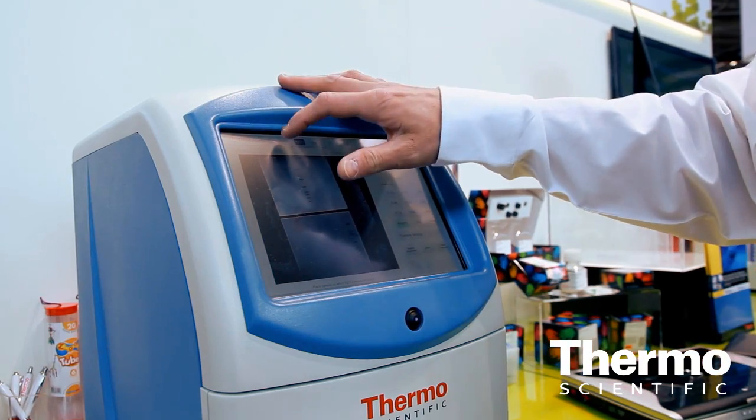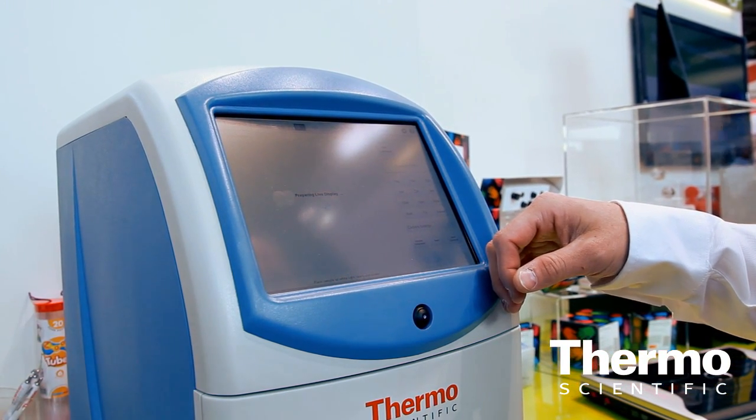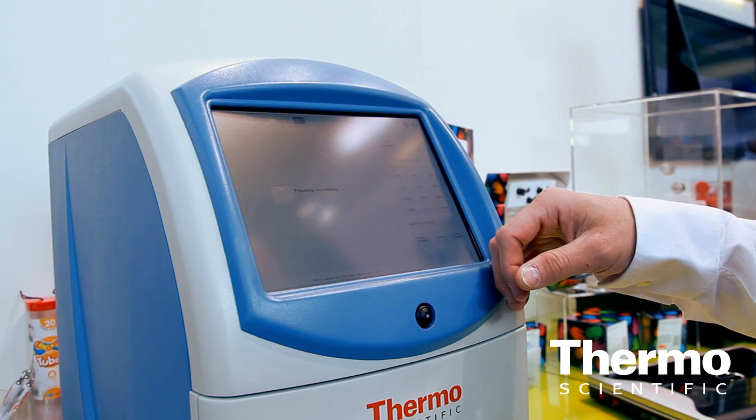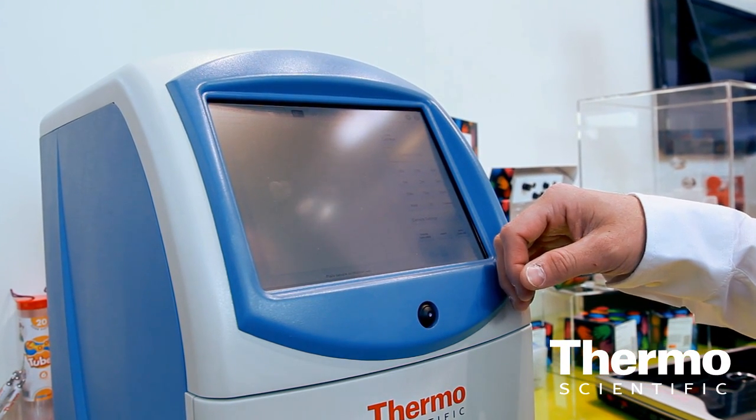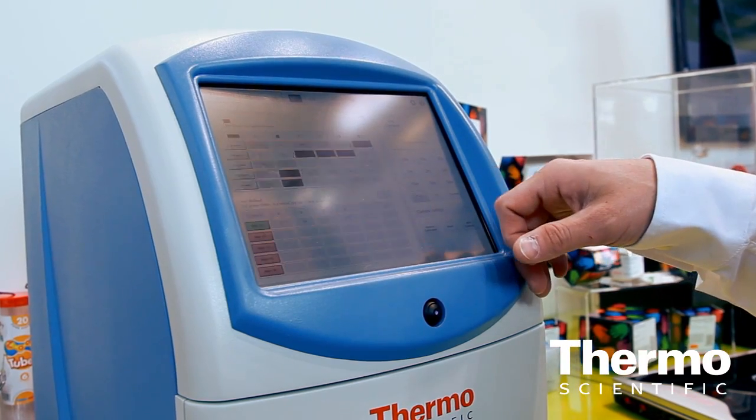With this, just with a few clicks of a button, you can immediately — or within a matter of minutes — have multiple exposures to actually select from, decide which one looks the best, and then move on to additional analysis. Not only a tremendous time savings, but a system like this, believe it or not, is anywhere from two to five times more sensitive than film. So you've got a dramatic increase in sensitivity and a dramatic increase in the dynamic range of the samples that you can look at.